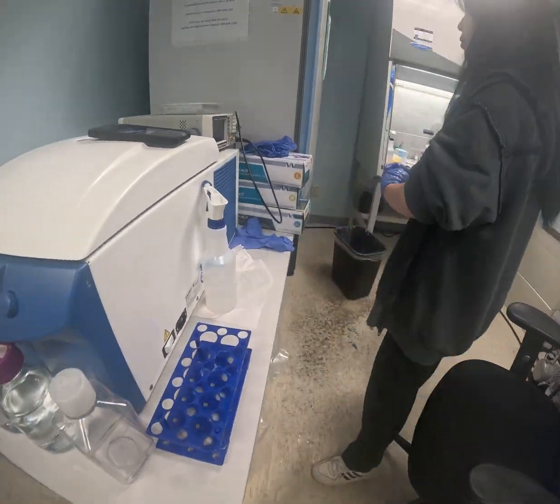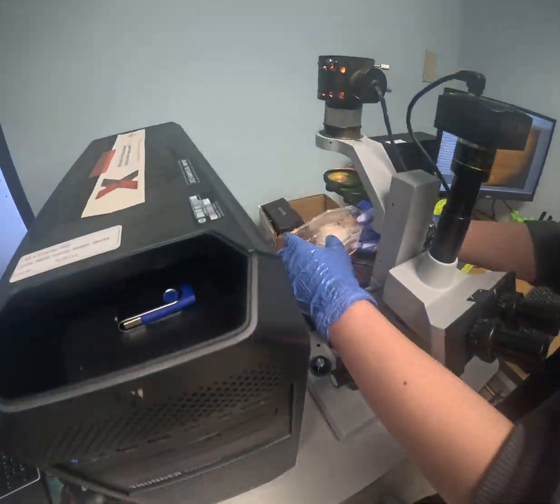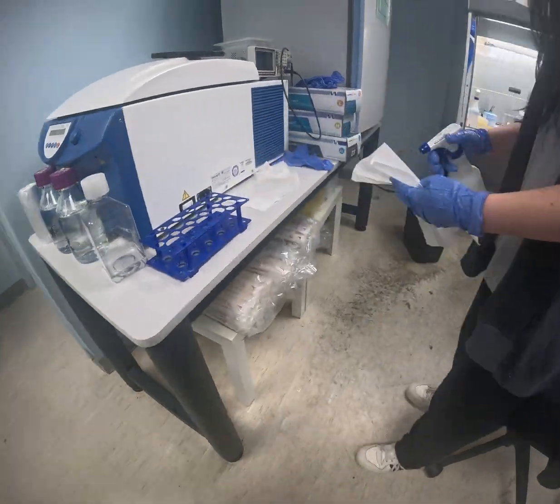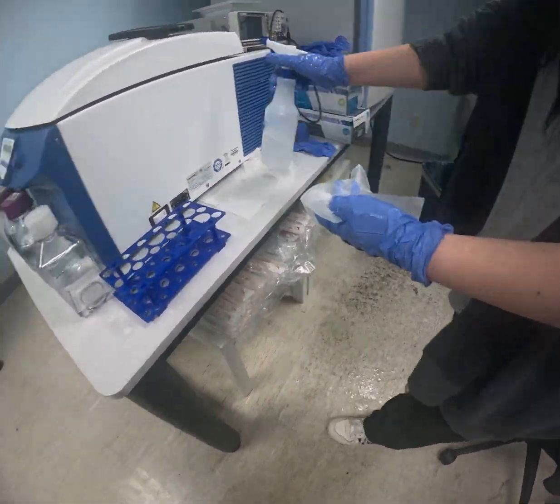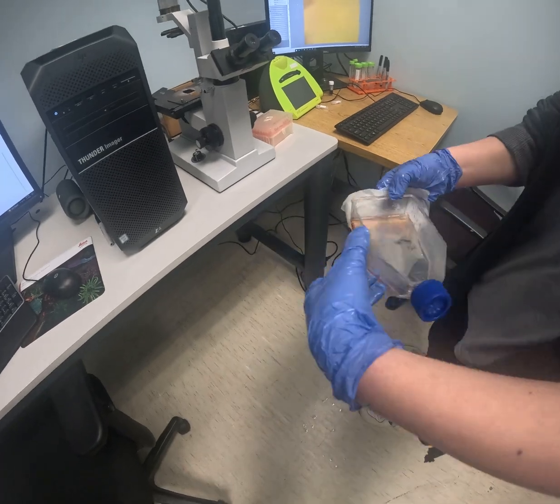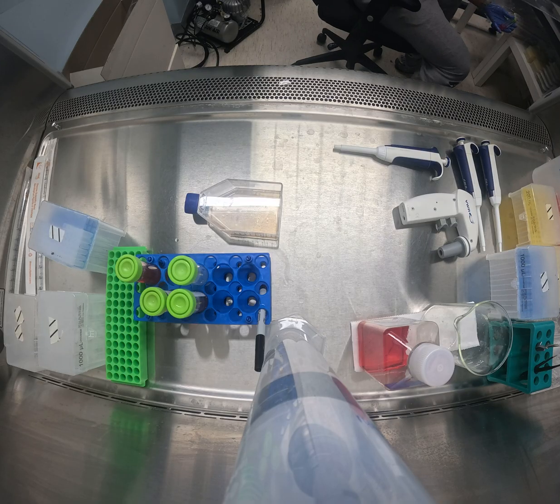Once your bench is prepared, we need to go ahead and grab the cells from the incubator. Anytime you enter the incubator, always clean your hands and keep in mind that you have one clean and one dirty hand. Then transfer the cells over to the light microscope and ensure that they are confluent before passaging. After ensuring confluency, wipe off the flask with a doused paper towel and place the flask inside the flow hood.